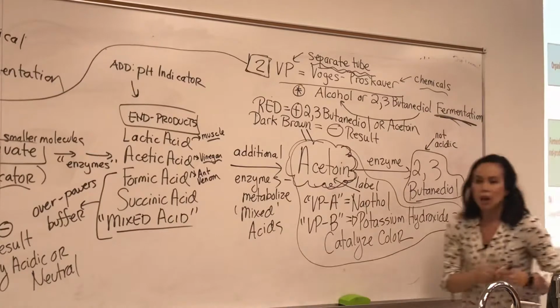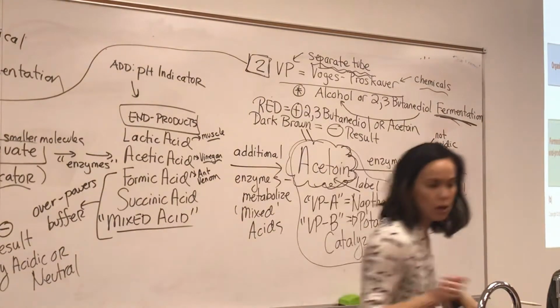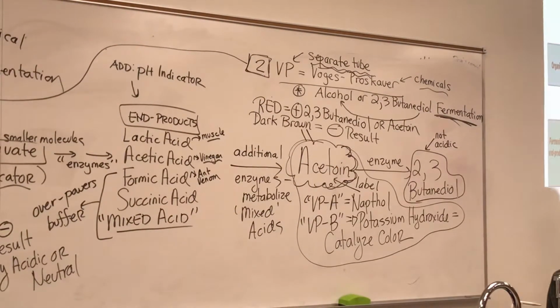Do you guys have any questions before I tell you how to head on? Just to clarify, these are both options for bacteria. So we're not looking for 2,3-butanediol in the first side, right?